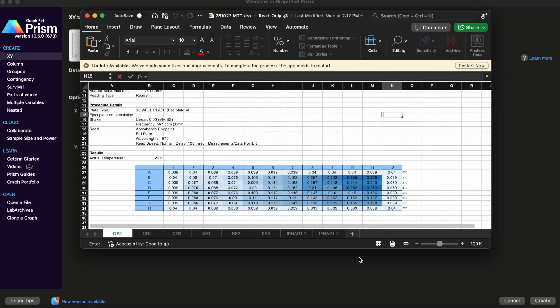Today we are going to do something a little bit different than usual. I am going to teach you how to analyze an MTT cell viability assay using GraphPad Prism.